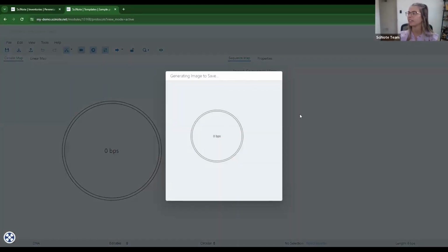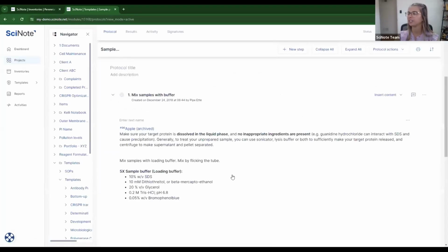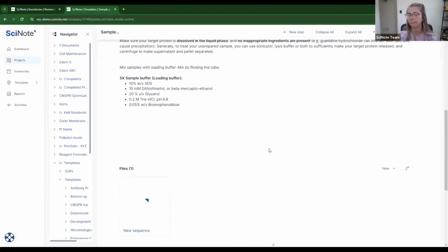So I'm going to save that there. And then it's added to your steps here.